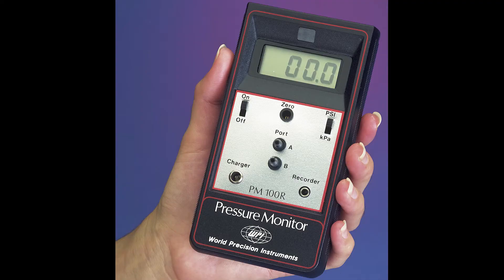The handheld and battery operated PM series pressure manometers monitor vacuum and pressure in non-aqueous fluids. An integral transducer and digital display allow easy and accurate pressure reading.